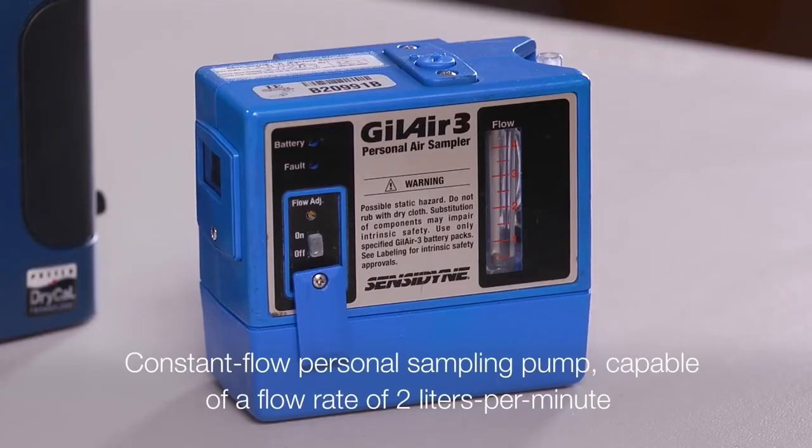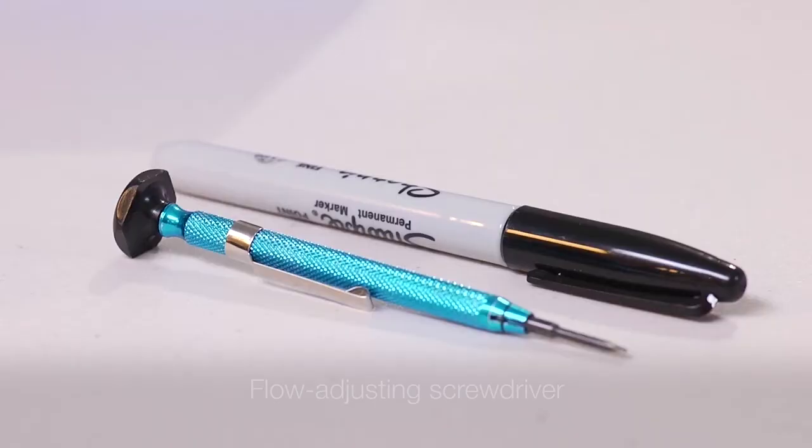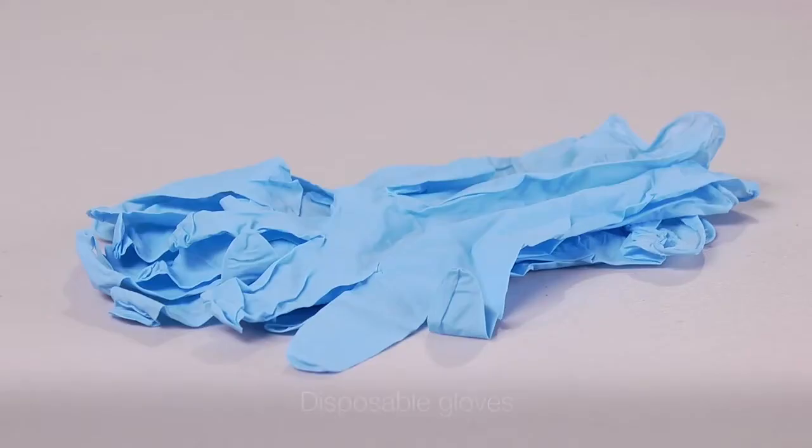Constant flow personal sampling pump capable of a flow rate of two liters per minute, calibrator such as a piston calibrator or bubble meter, a flow adjusting screwdriver and disposable gloves.